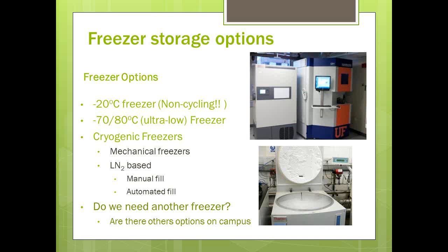So just don't do the knee-jerk buy freezers. Think about, are there ways that I can synergize and work with other groups that maybe already have systems in place to help store my samples?